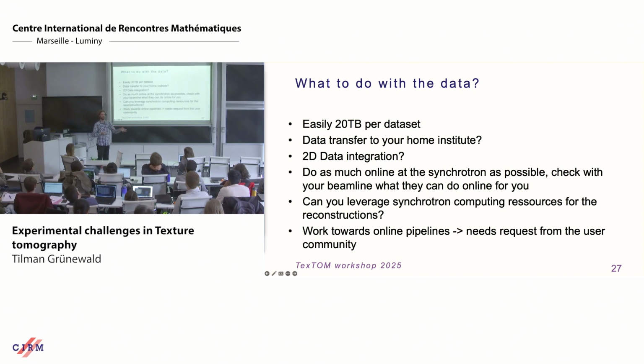I mean, it's great if that works for you, but if you want to build a community and have these experiments easily, we kind of need to agree on certain ways of doing it at a certain Beamline at least. There's also a lot of computing resources available at synchrotrons that we should tap into. Not everybody needs to buy a 50K computer to do their reconstructions. One way, of course, would be going to the Dectris cloud. Another one would be to use the computing resources that we have available. I cannot overstress that having these kind of pipelines unified will make it easier for us as a community.